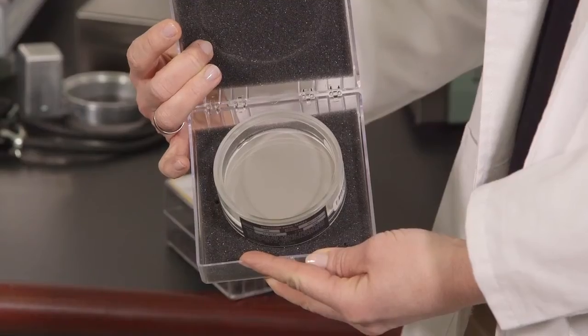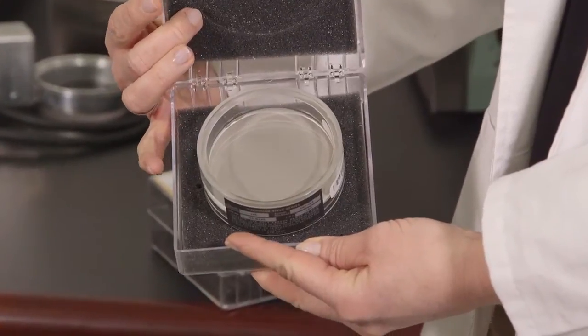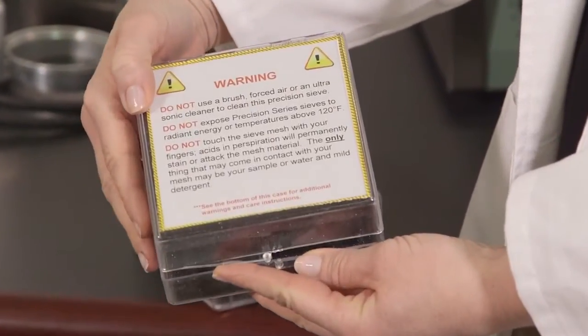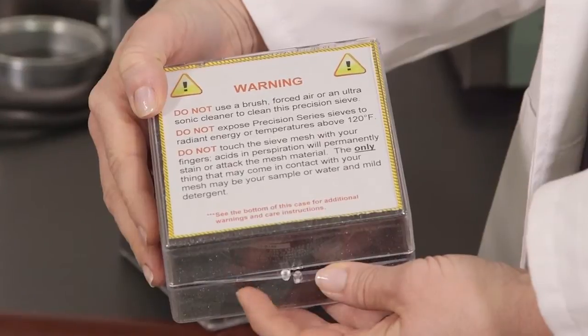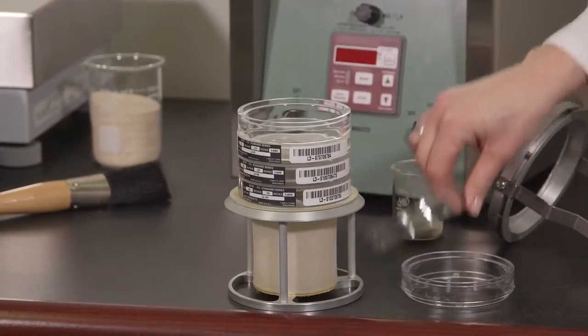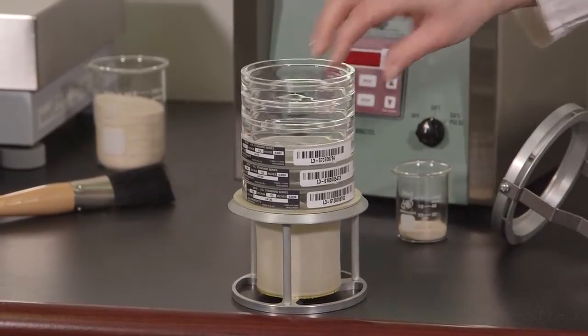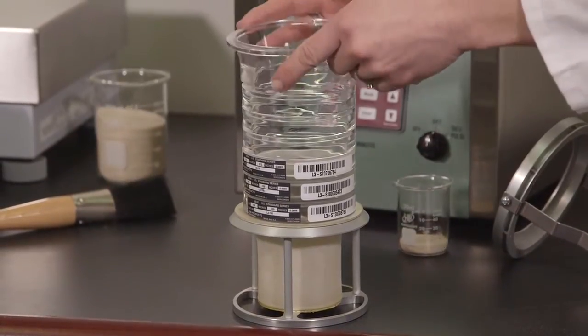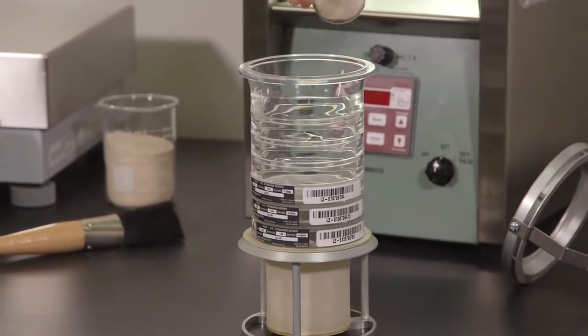When using electroformed precision sieves, be certain to refer to the care and handling guidelines on the sieve case. If fewer sieves are used, add spacers at the top to fill out the stack to the required height. Add the top cone and introduce your sample.